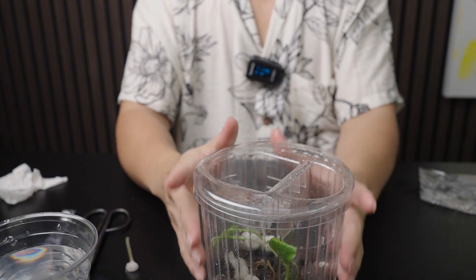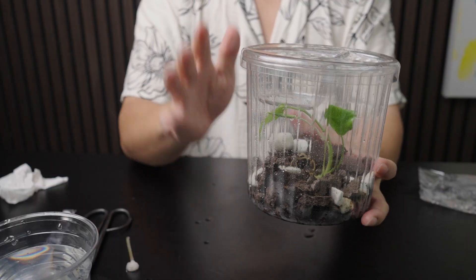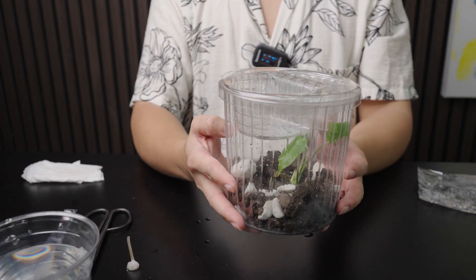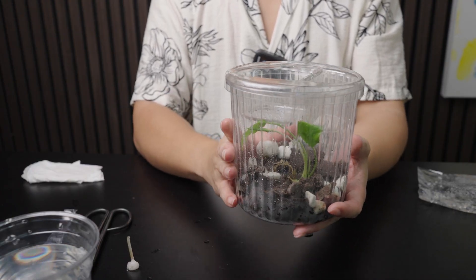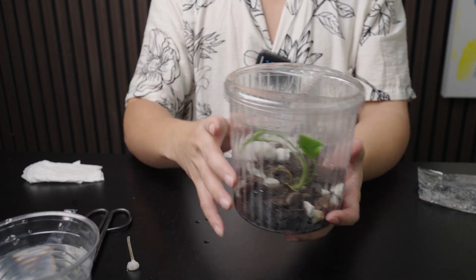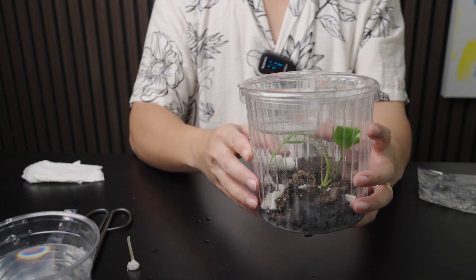We are in Singapore, so humidity is naturally quite high. If you are in a drier climate, you might want to have something to cover the larger holes as well. And this is how we deflask our tissue culture plants. Once this is hardened off in about two to three weeks, we will be putting it on top of the Grow Lid with a grow pole, where it will grow hydroponically and hopefully grow big very fast.